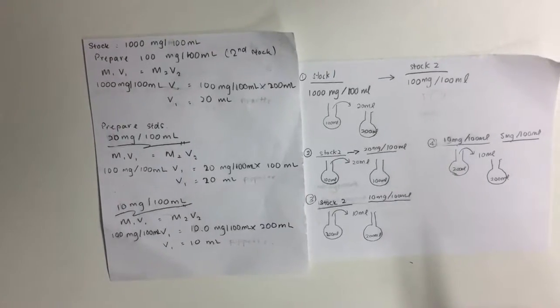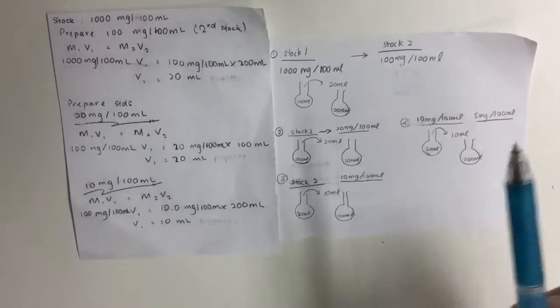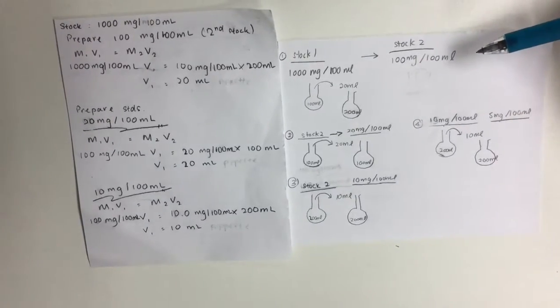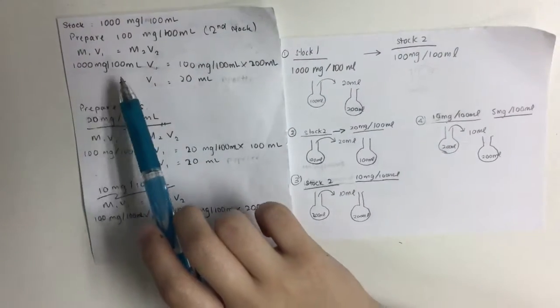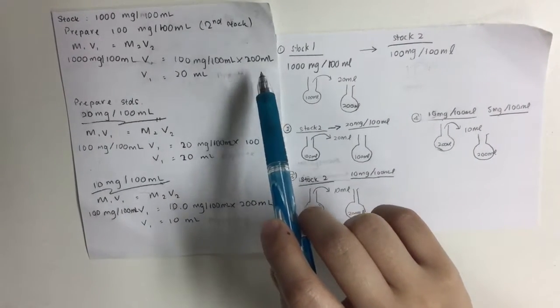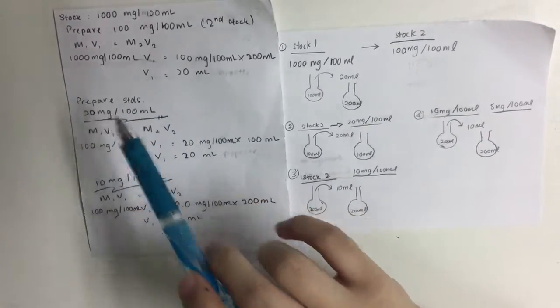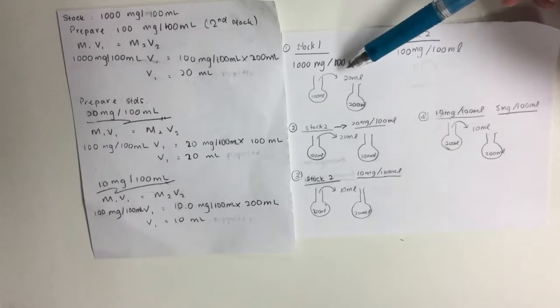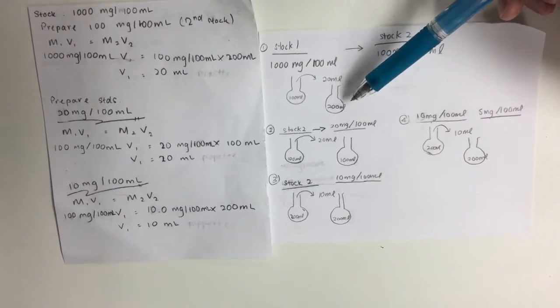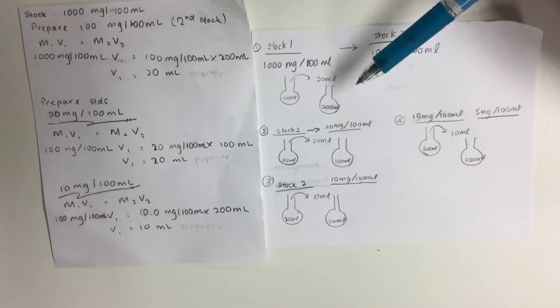To prepare the dilution for the standard solutions using the equipment available, first we will need to prepare stock 2, which has a concentration of 100 mg per 100 ml. By using the equation M1V1 equals M2V2, we will fix the final volume to get the volume needed from the stock. So we will take 20 ml from stock 1 into a 200 ml volumetric flask and fill up the volumetric flask, and it becomes stock 2.